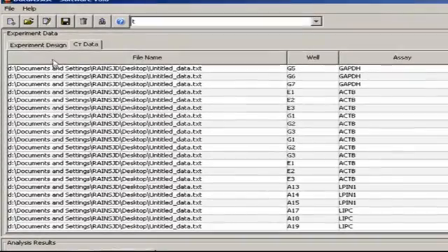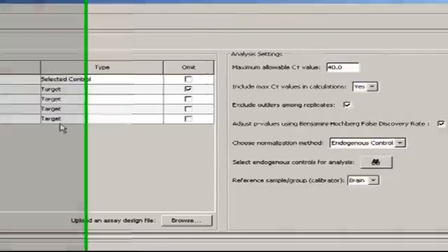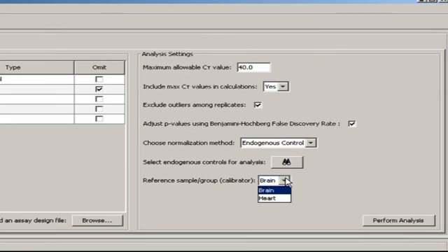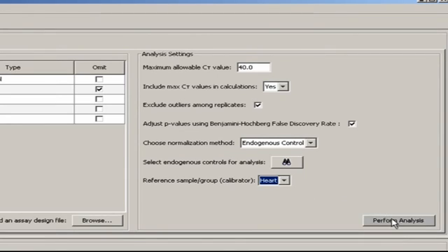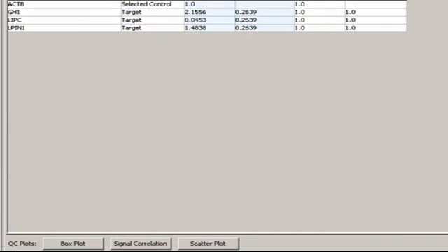It's also calculated p-values based on a one-tailed t-test for significance. Now, if you decide to change any settings at this point, such as which group, brain or heart, is the reference, just make the desired change and hit Perform Analysis. Let's have a quick look at the many quality control and results plots that DataAssist generates.